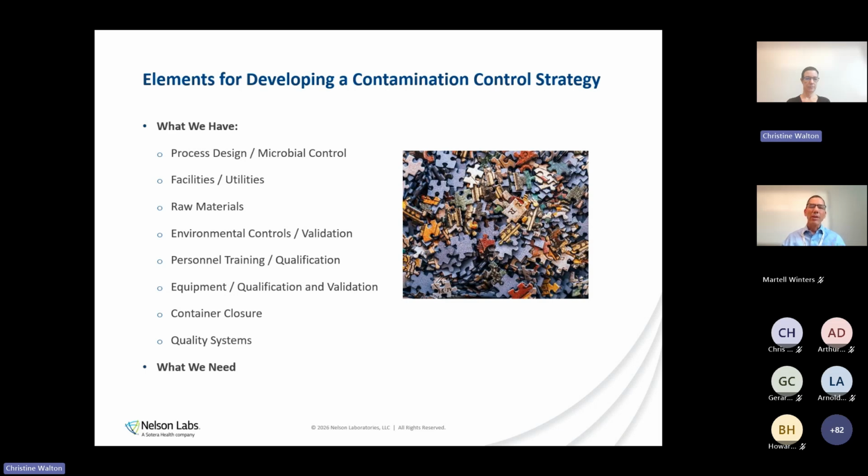So when we're talking about an overall contamination control strategy, this is a concept that is largely driven in the drug industry, and it's a great approach whether it's a non-sterile product, a terminally sterilized product, or an aseptically processed product. They all will benefit from having an overall contamination control strategy, or CCS.